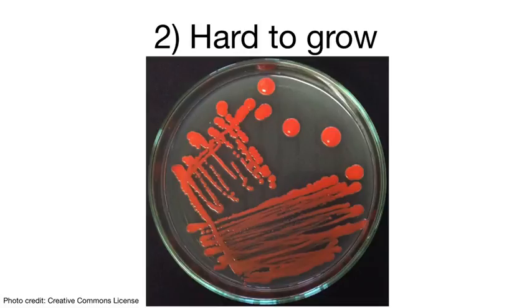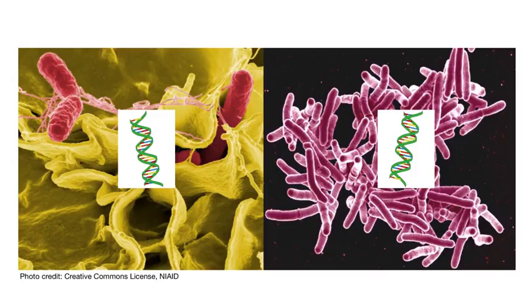The second challenge with studying microbes is that the majority of microbes, especially gut microbes, cannot be easily cultured. Many of the methods Norm discussed in the last lecture require us to grow the microbes to study them. Using DNA to identify microbes solves both of these problems.